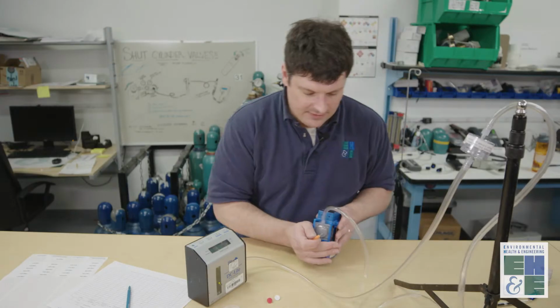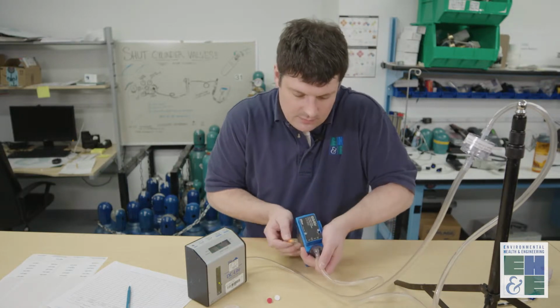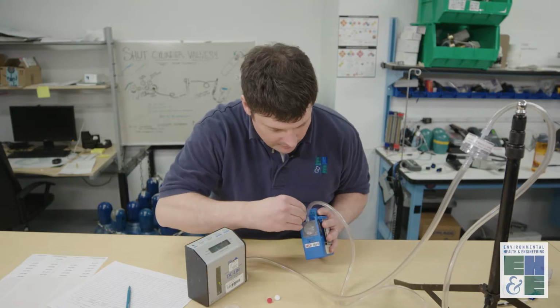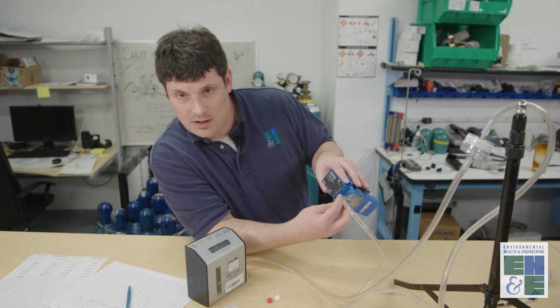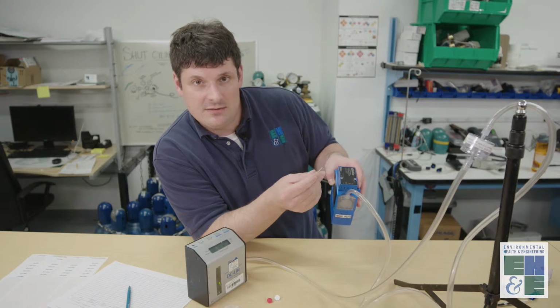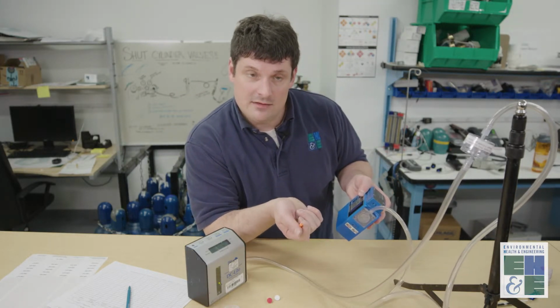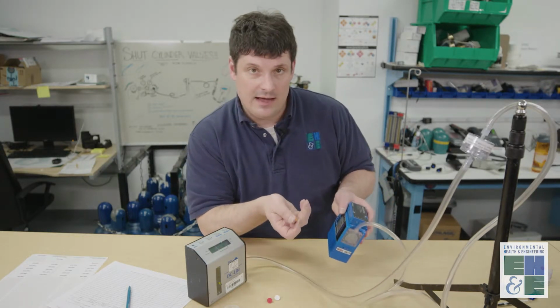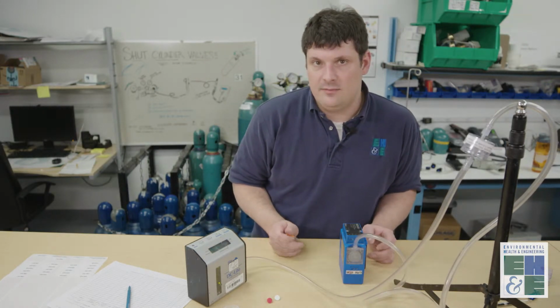This pump also has a high and low flow adapter on it, right here. Right now it's set to, or I'm setting it to on, which means low flow, but typically less than 0.5 liters a minute. But in this case, I want to set it to 1.5 liters, so I'm going to turn it off. And so that will allow me to do that above 0.5 liters. And it also depends on the media, the back pressure across the media.